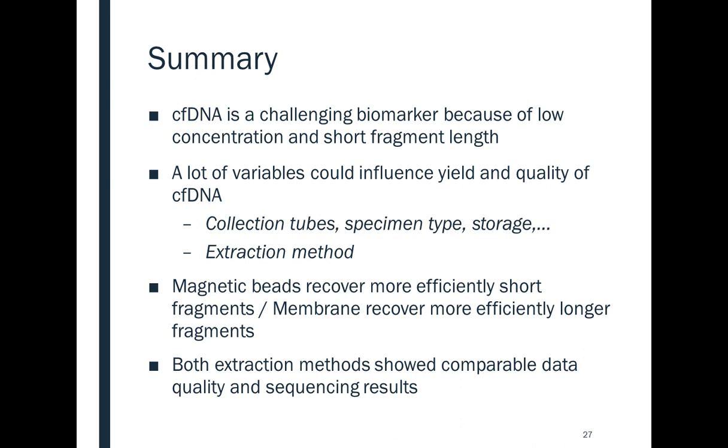Do you think stabilization chemistry, such as cross-linking, use of formaldehyde, impact extraction efficiency or workflow? Yeah, it's like FFPE. It's also formaldehyde cross-linking, and it has great influence on the subsequent NGS analysis.